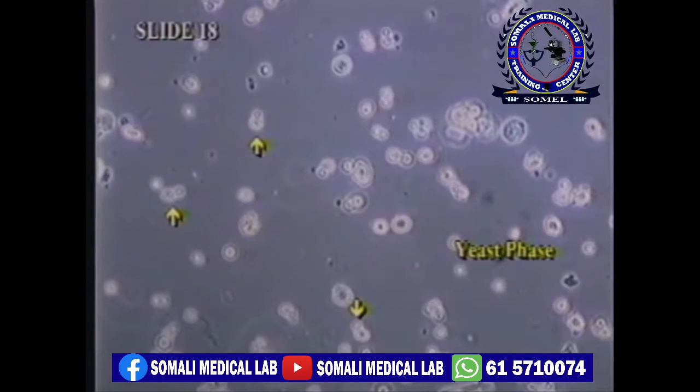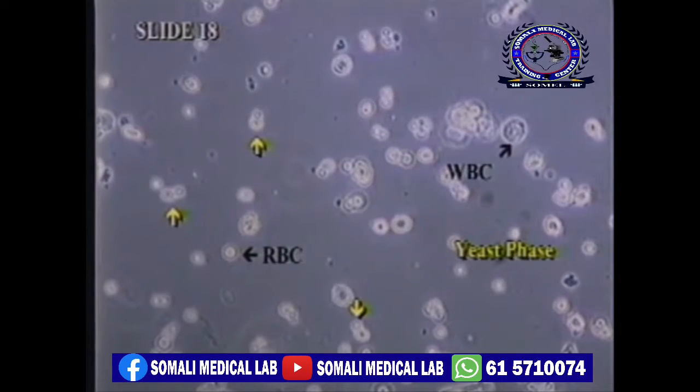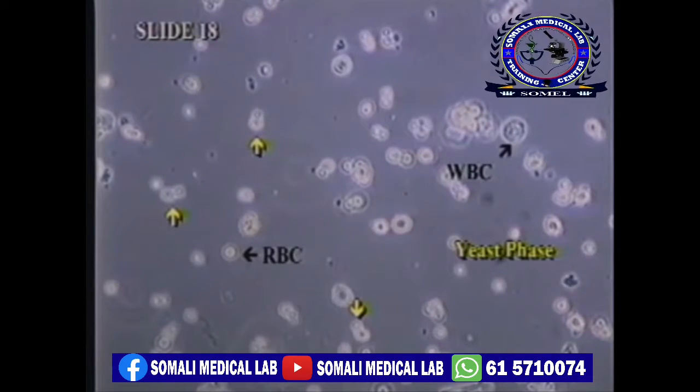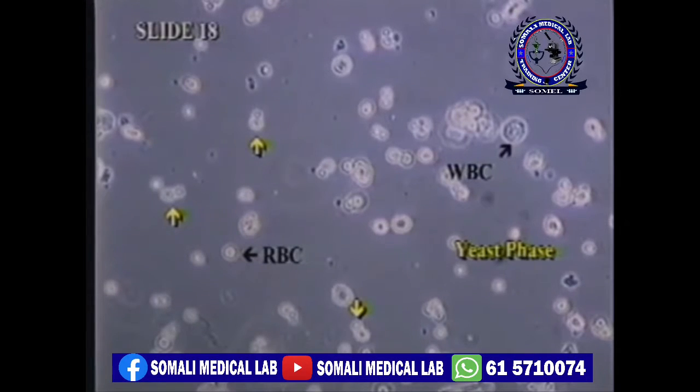The sample shown under high power phase has both budding yeast as well as red blood cells and white blood cells. If you cannot tell the yeast from the red blood cells, it might be helpful to add a small amount of dilute acetic acid to your slide and see what disappears. The red blood cells will lyse and the yeast will remain.